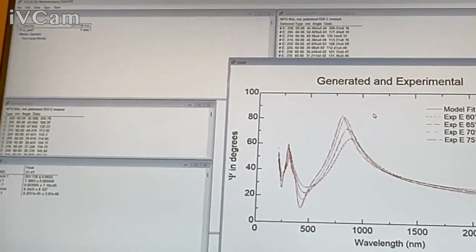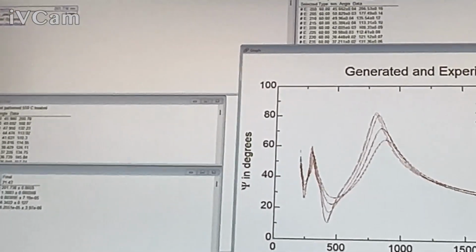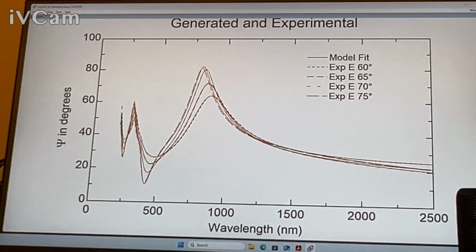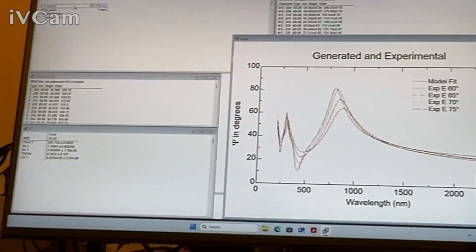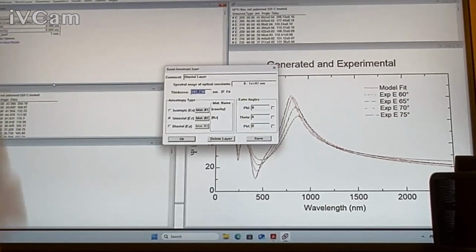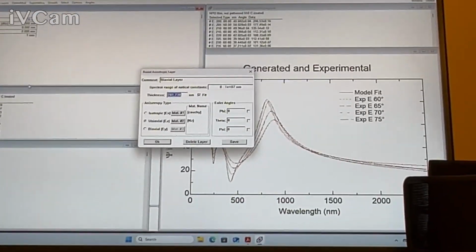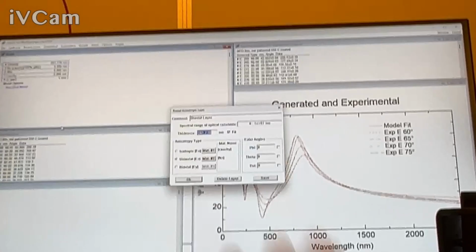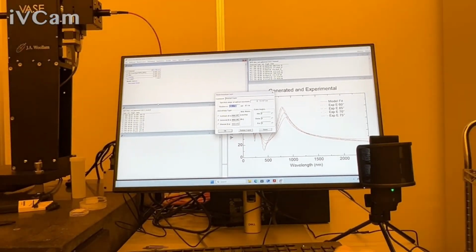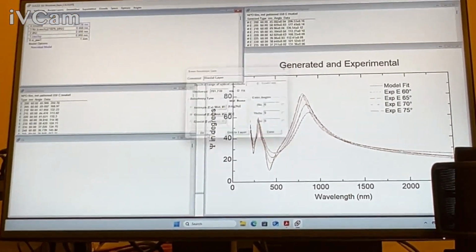The very last thing I would try for fun, which I don't think is going to happen here, but we'll just try it to see if it changes anything. I'm going to try to add uniaxial anisotropy, because I mentioned sometimes you have these porous materials. It depends on how it stacks. Sometimes it's not uncommon for these to exhibit some type of uniaxial anisotropy. So I'm just going to check real quick if it does.